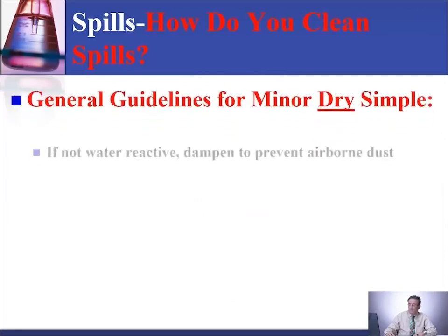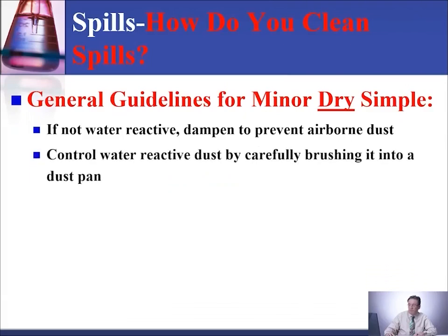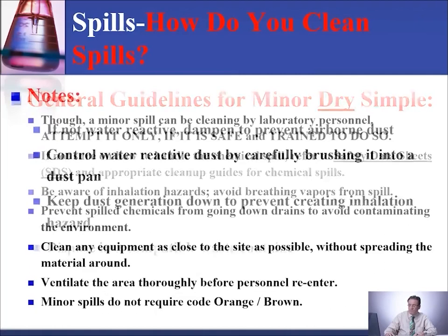General guidelines for a minor dry simple spill. If not water reactive, dampen to prevent airborne dust. Control the dust by carefully brushing it into a dustpan. Keep dust generation down to prevent creating an inhalation hazard. Dispose in a compatible waste container.